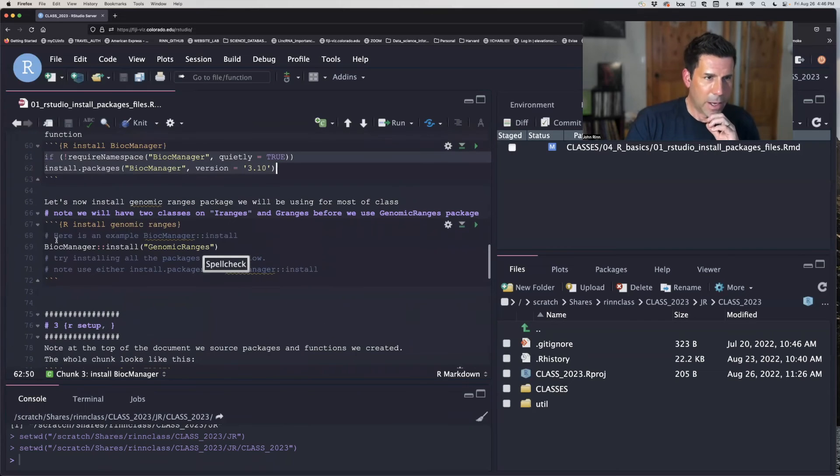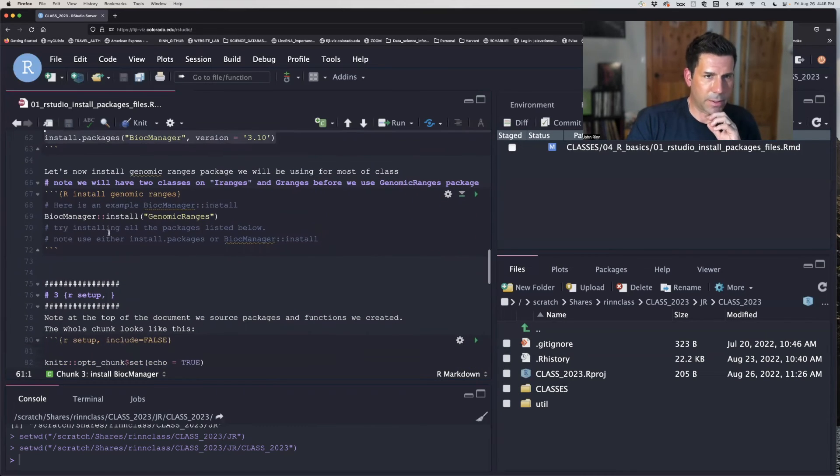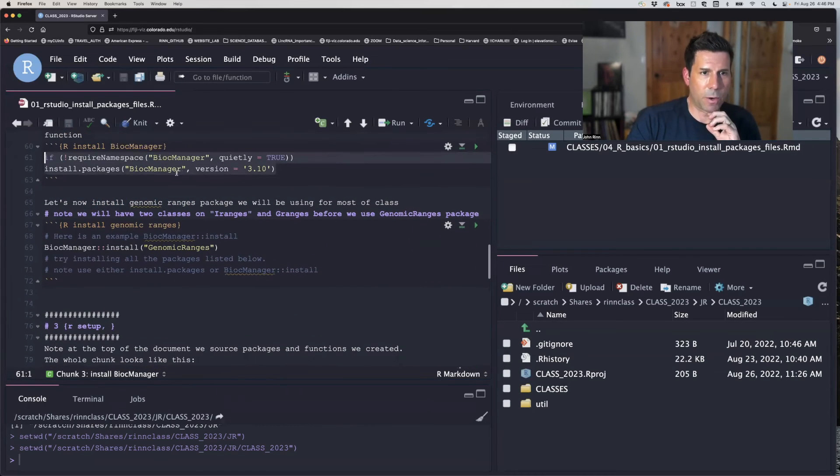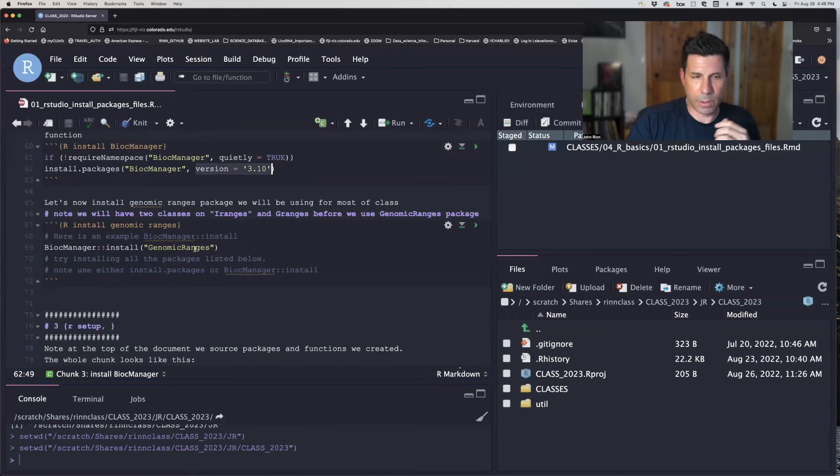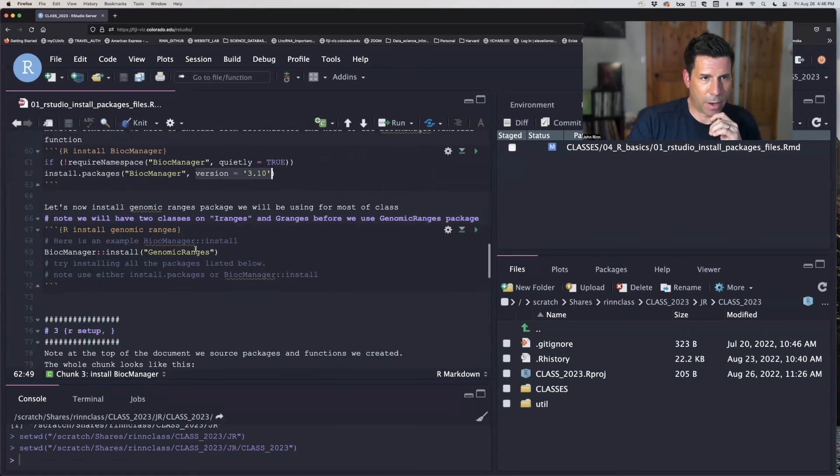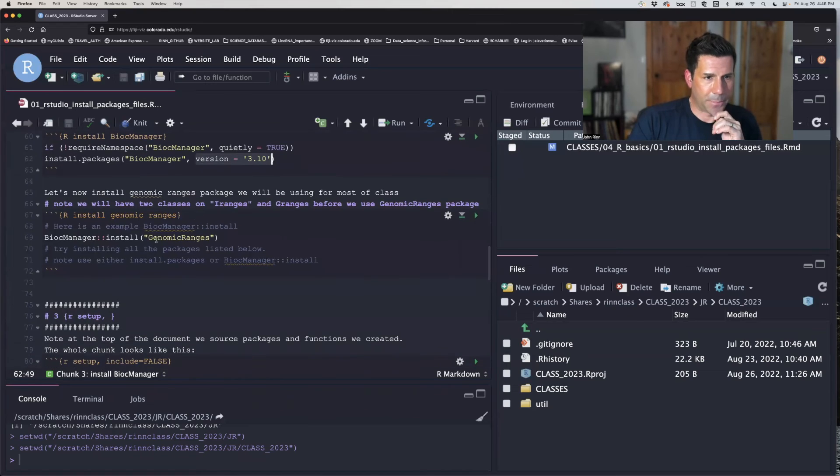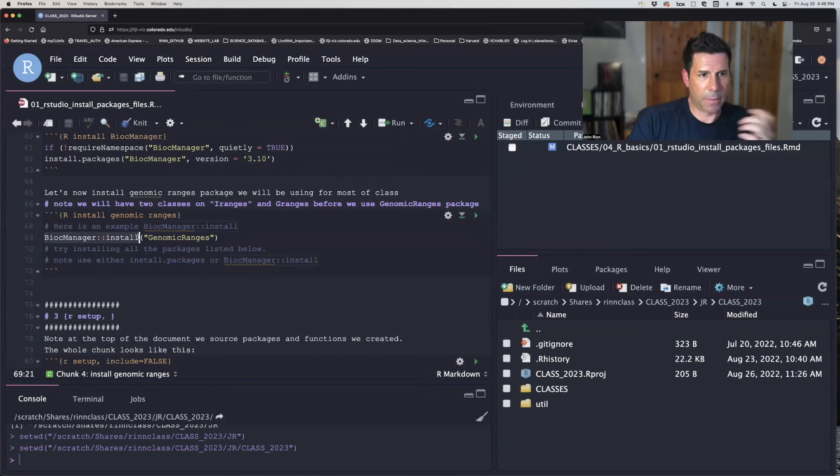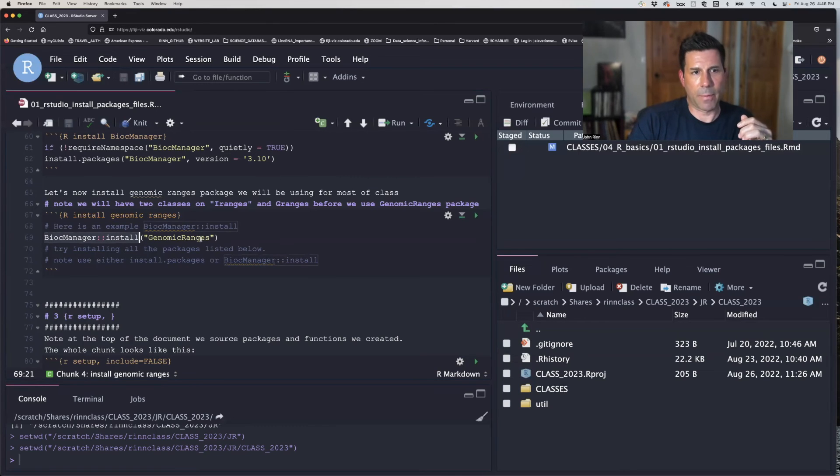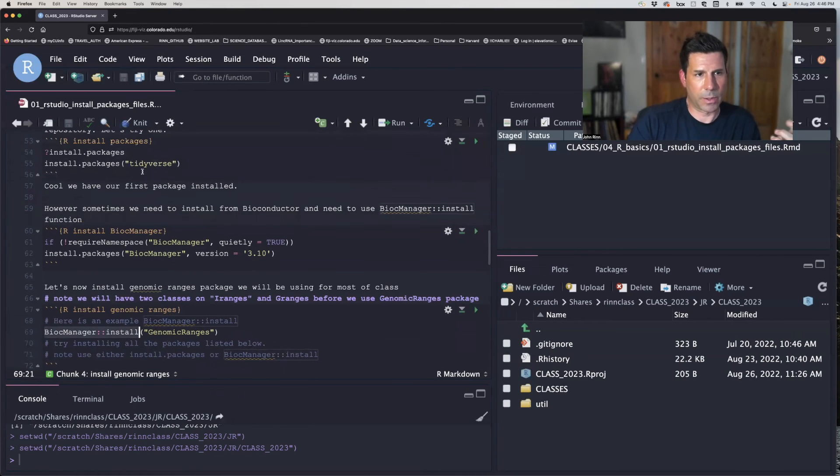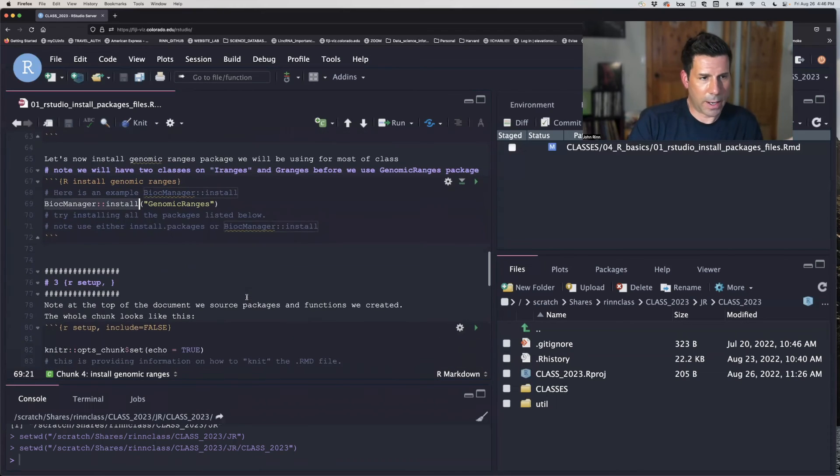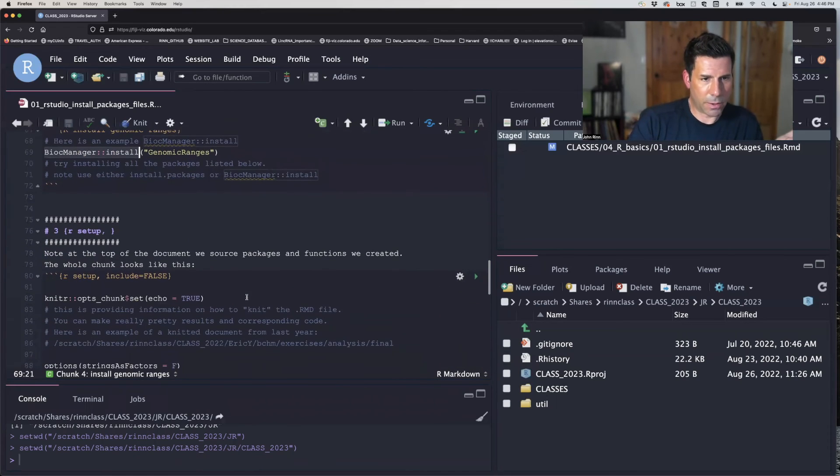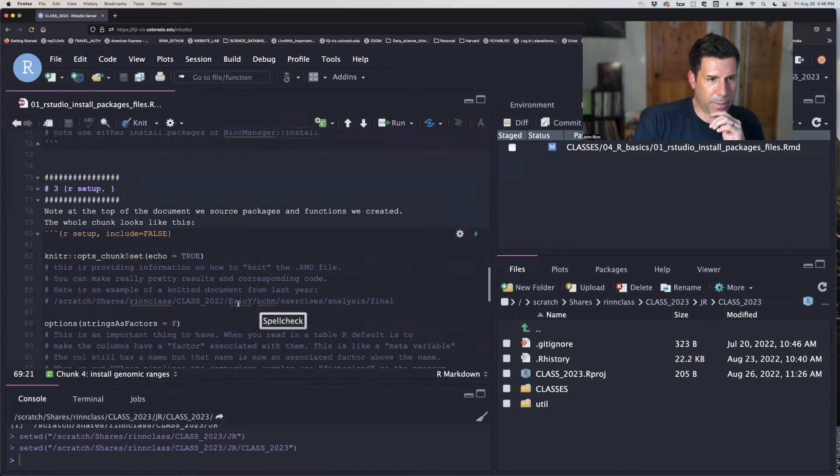So once you have the Bioc manager installed, you're good until the next version you want. And that's here. And you can look on their website and see which version you prefer to have with your R setup. And then there's to run that the same way we did install.packages. You do Bioc manager, colon, colon, install, and then the name of the package, quite similar to what we did for Tidyverse. So go ahead and install those. You might want to pause the video. It's going to take a little bit.